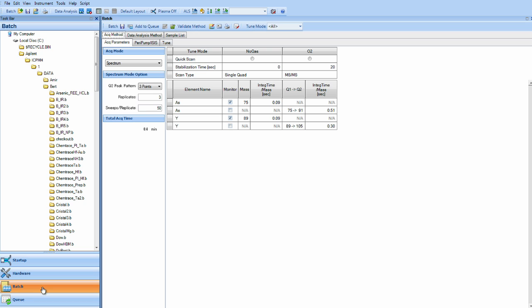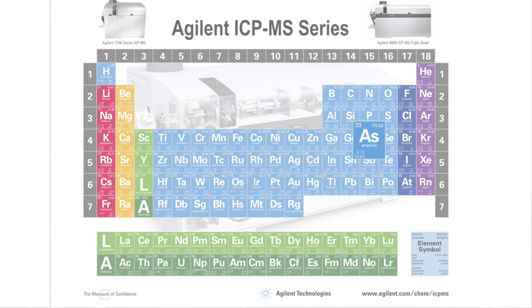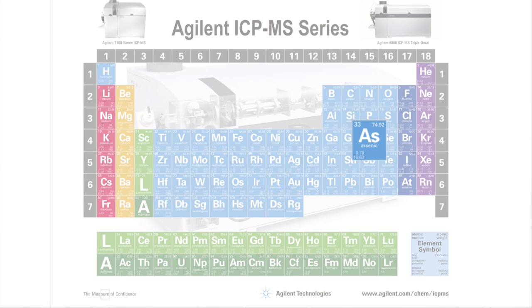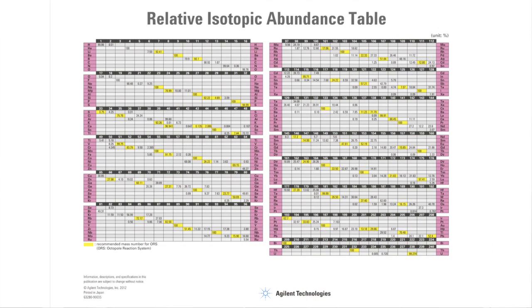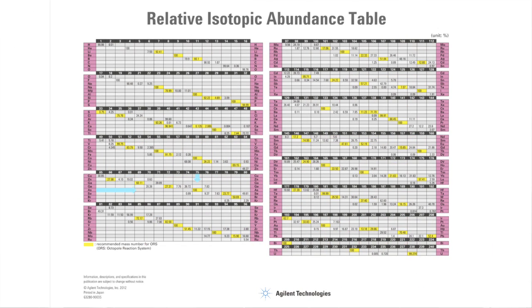In the batch, we can select whatever mass we want to use or whatever mass shift we would like to do, depending on the type of analysis we're doing today. In today's case, we're going to look at arsenic. Arsenic is monoisotopic, which means it has one isotope, mass 75.